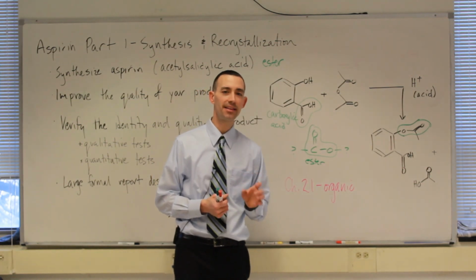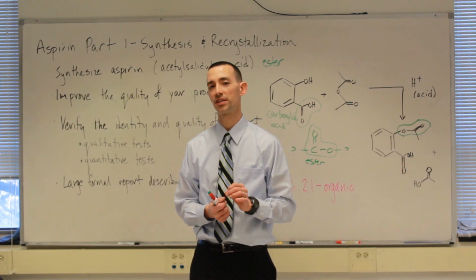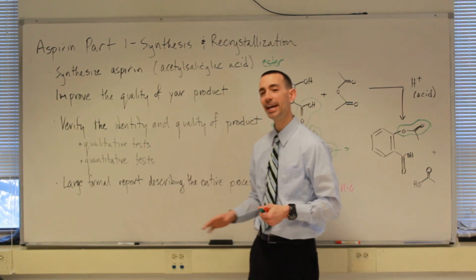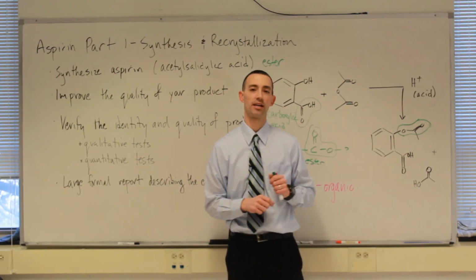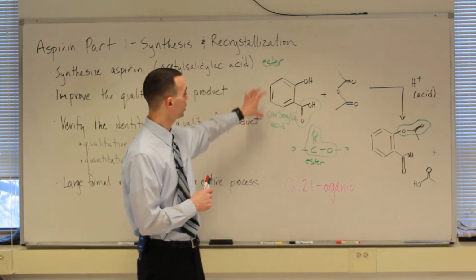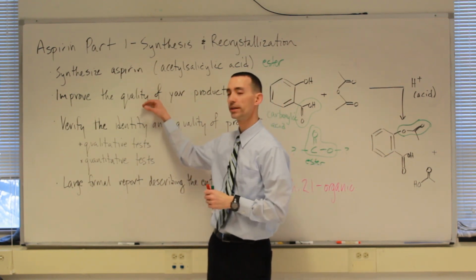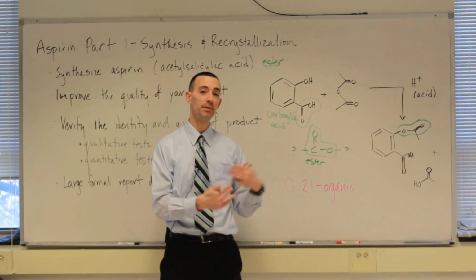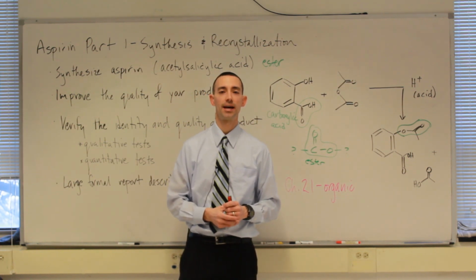But if you take anything more than 10 seconds to look at them, you will see significant differences that you can describe and use to make your claim that you successfully turned salicylic acid into acetyl salicylic acid. And so good descriptive notes are important, not just for the salicylic acid, but for the raw and then improved recrystallized aspirin samples. So the more notes you have, the more you'll be able to demonstrate to your lab instructor that you've successfully achieved the goals of this lab.